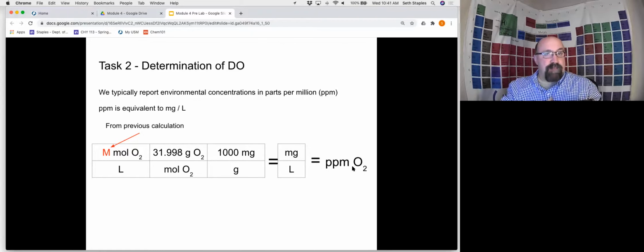Read back through your lab manual. Watch this lecture video again. The more you watch it, the more you see what's going on, the more things will make sense. And so, like I said earlier, the idea behind this video is really to give you a lot of the background and to introduce you to how you're going to do your analysis and perform your calculations. Your instructor will be talking about how to actually perform the experiment itself, some of the details involved in how you're going to run the titration.